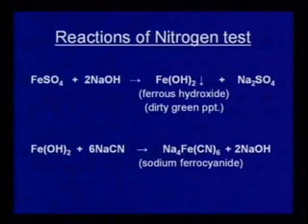That is why I told you that if you are not getting any precipitate, that means the sodium hydroxide is not present, because ferrous sulfate you are adding from outside. So you have to add sodium hydroxide so that you get the green color precipitate.